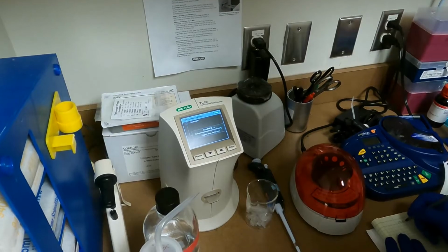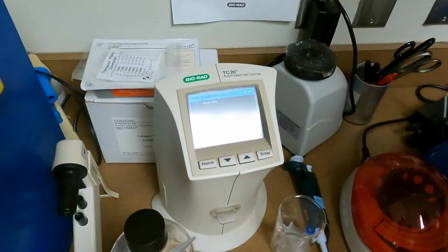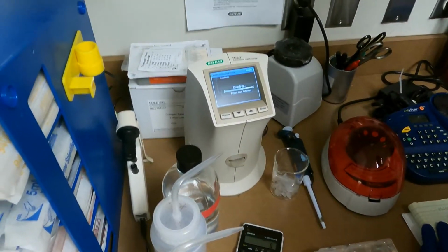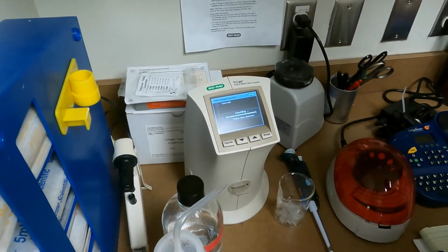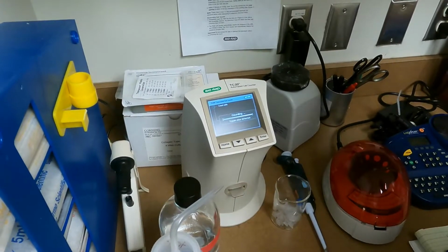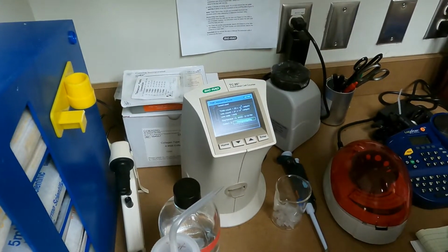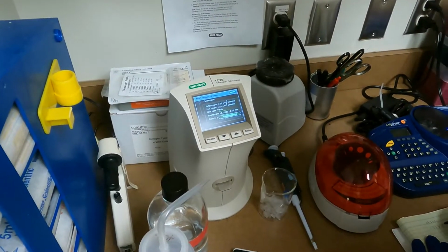First one. So it's detected the trypan blue. And that tells you how many cells are alive and how many are dead. If it takes up the trypan blue, they're dead, okay? If it doesn't, then they're alive. So it'll give us a live/dead count, as well as the total number of cells. Right, so we've got 1.22 times 10 to the 6 on this one.